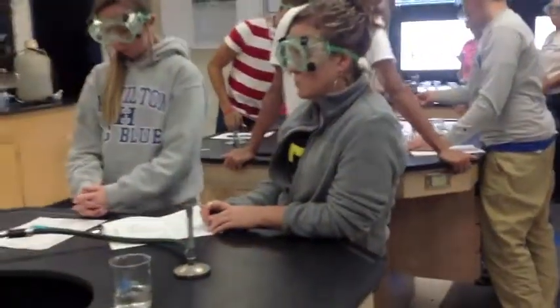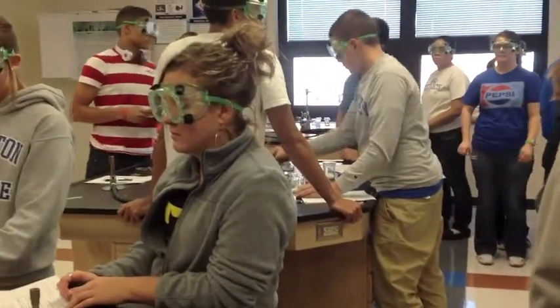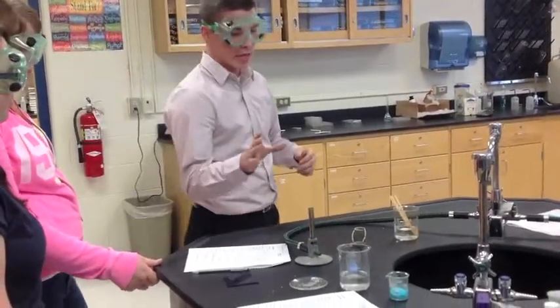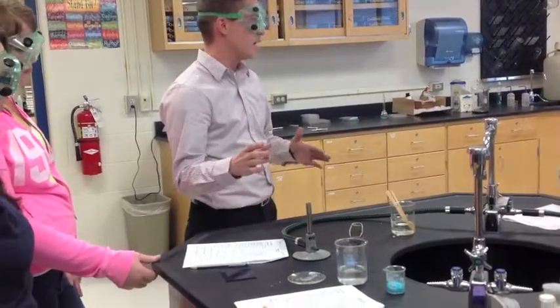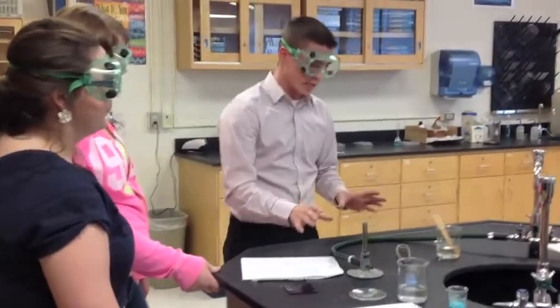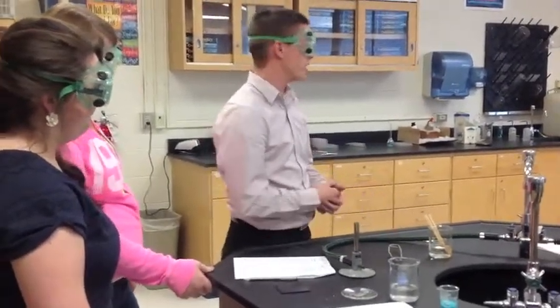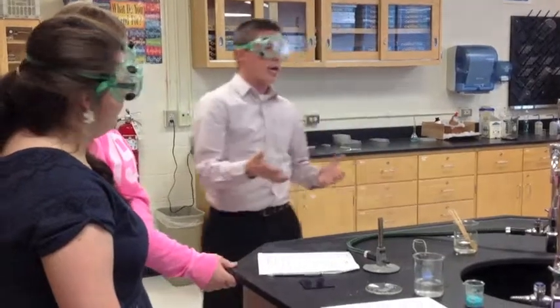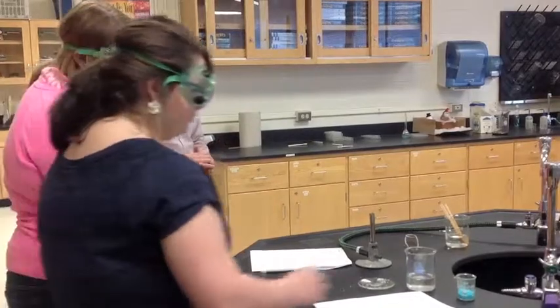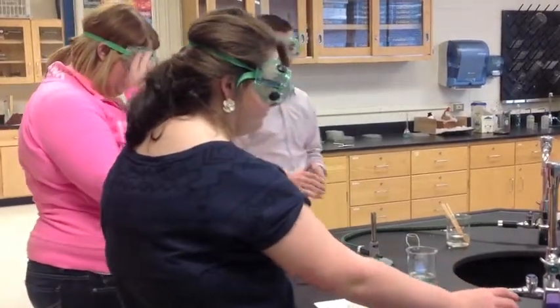Before they ever start to take anything off of their desk, before they start to move, they're going to shut off their Bunsen burner. You listening, Tyler? At this point, do not try to touch the Bunsen burner because it conducts heat, so it will be hot. But the rest of your materials you can begin to clean up. Organize these chemicals in a nice orderly pile, and then you can wipe off your desk.